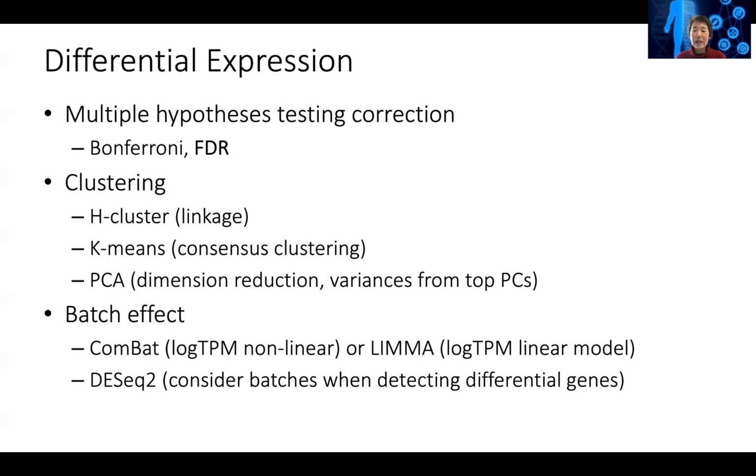You will not really get a normalized matrix for downstream analysis. So if you also need to draw a PCA plot or do other classification, you can still run DESeq to get the differential genes, but you will not get that matrix to do the downstream analysis.